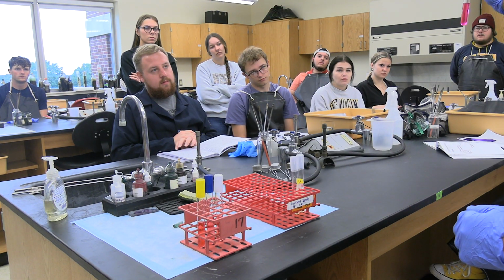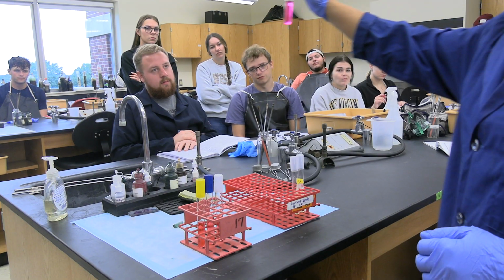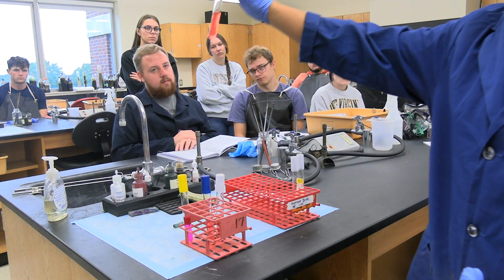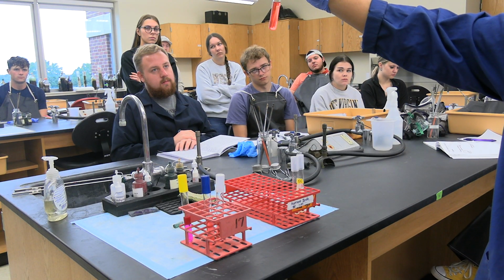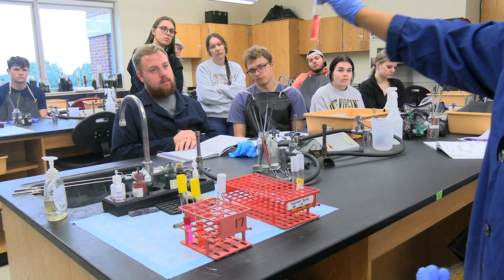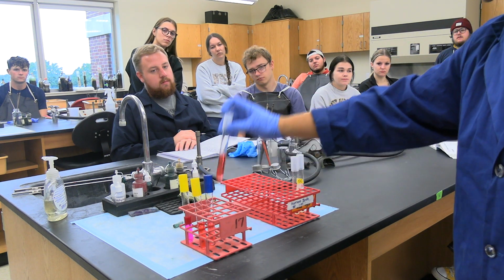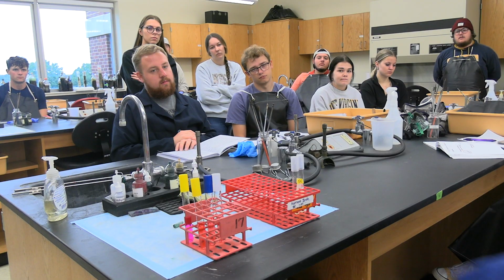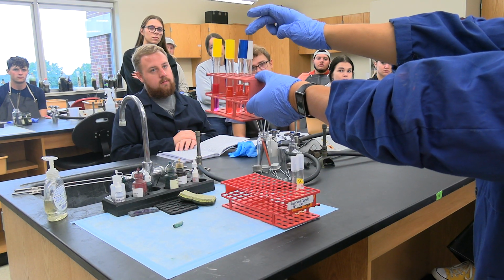What is this? Urea tube. Looks rose pink. What is this one? Glucose. What is this? Sucrose. What's that? Lactose. How do we know it? The color of the cap.